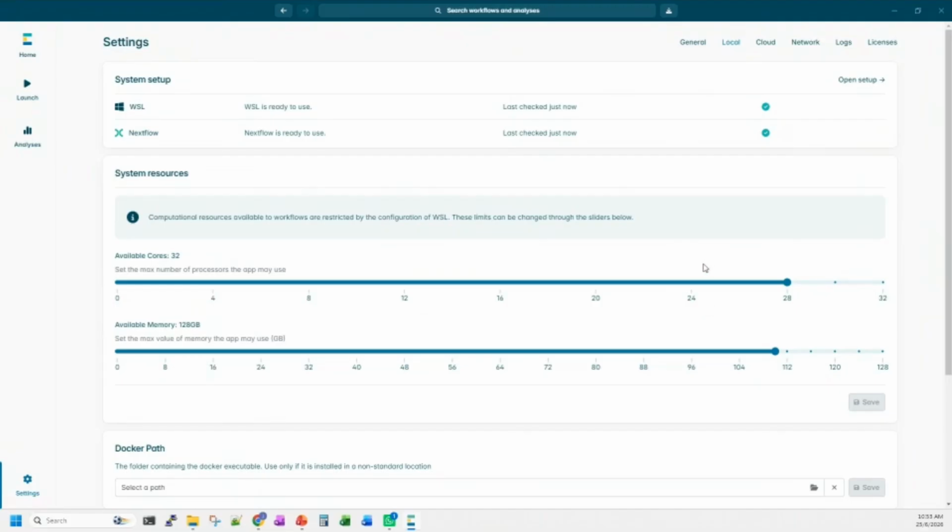And then when we submit the 4th process, Nextflow will arrange the resources, because we might not have sufficient 8 cores or 8 CPU for the 4th process. Then it will put the 4th process into a queue, waiting for the other processes to finish first. So it helps with managing all the tasks, so it won't crash the computer.